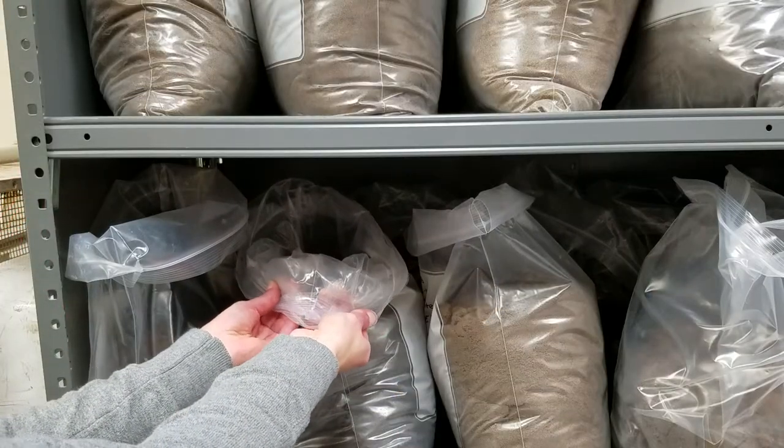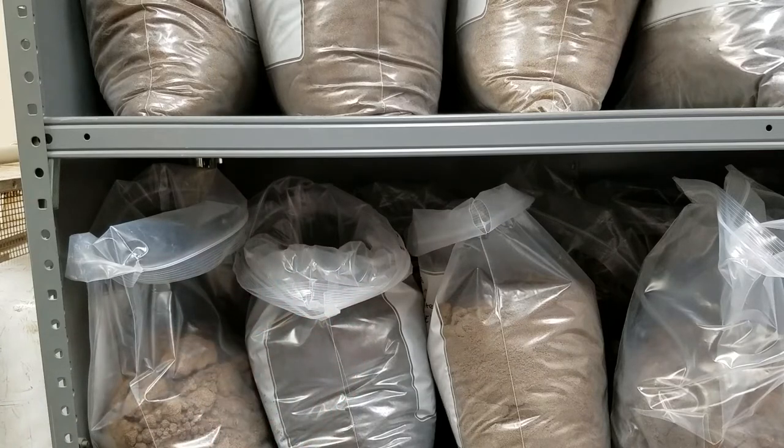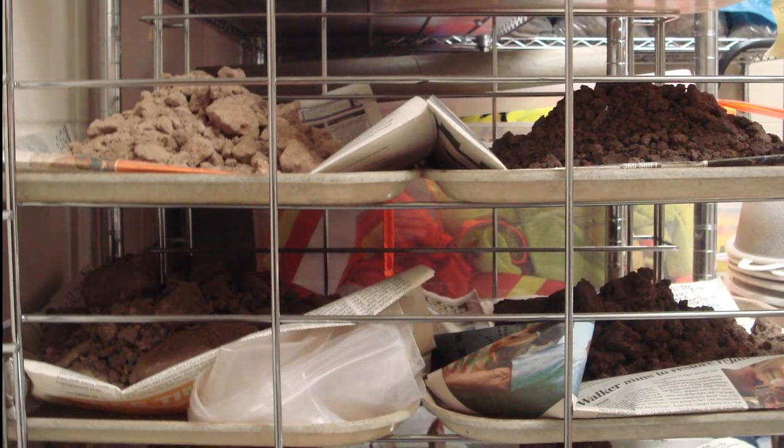The samples are brought into the lab and the bags are opened to let the soil dry. The soil must be completely dry or the light fraction won't float properly. Spreading out a soil sample on a tray can help it dry more thoroughly.